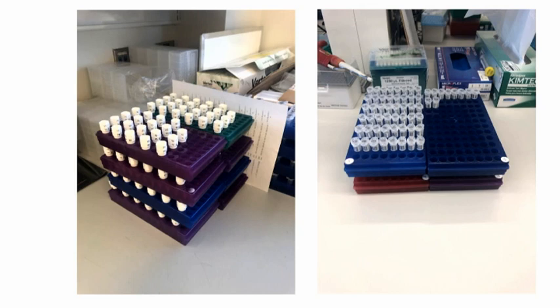Importantly, you can't put a sticky label on, right? You can't put it on the glass because it influences the process of the machine. And if you try to find somewhere else on the tube, you either can't read the barcode anymore, or you end up with a label that goes across where you actually take the screw top off. So they're just labeled by hand. We haven't figured out a better way to do it. If anybody has any ideas, I'm all ears.